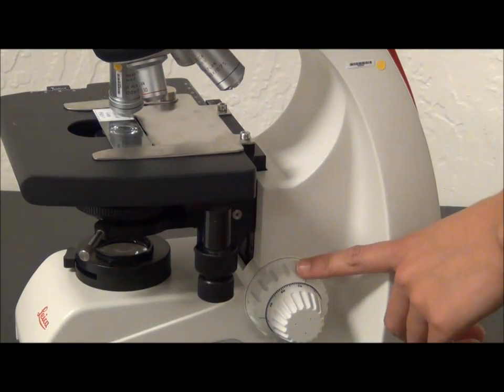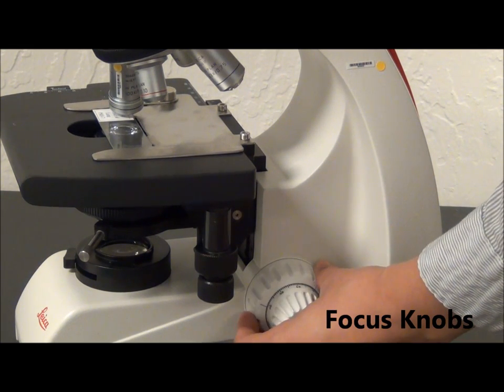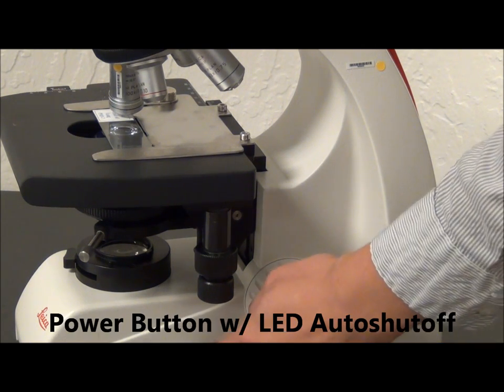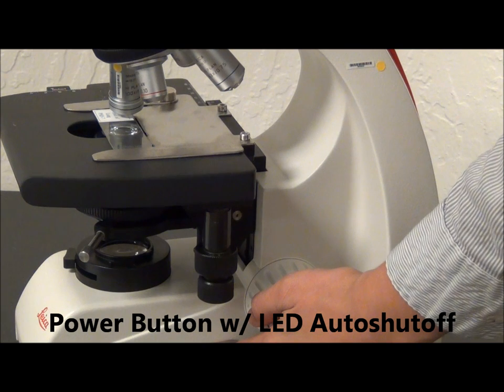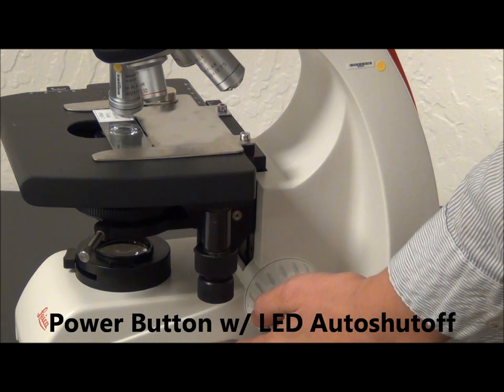On the side here, we have the microscope's focusing knobs. The outer focusing knob is a coarse focus and the inner focusing knob is a fine focus. We also have the microscope's power button here. The LED has an auto shutoff after two hours, which you can disable if you choose.